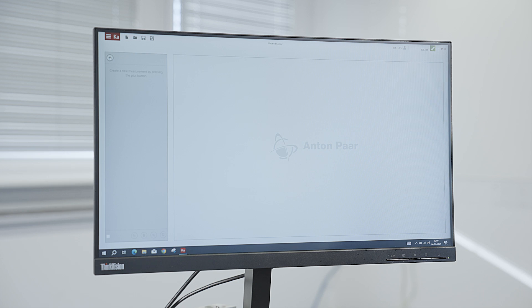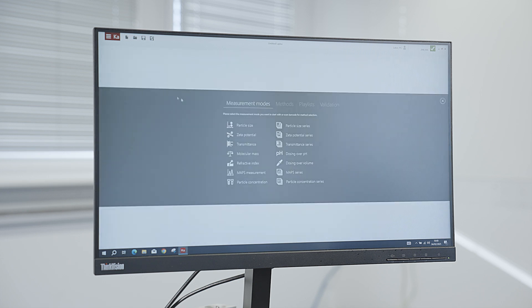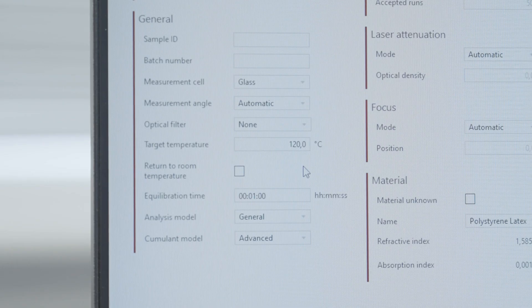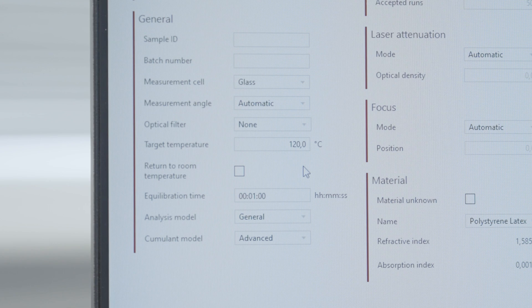LightSizer DLS instruments equipped with the BM11 module offer a large temperature range. Every measurement mode can be performed at temperatures between 0 and 120 degrees Celsius.